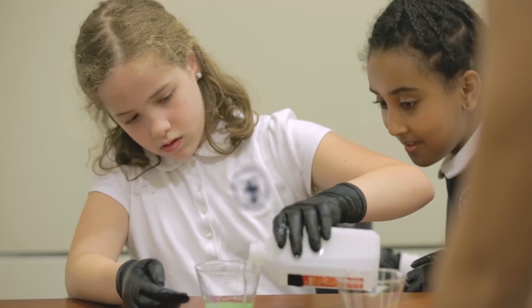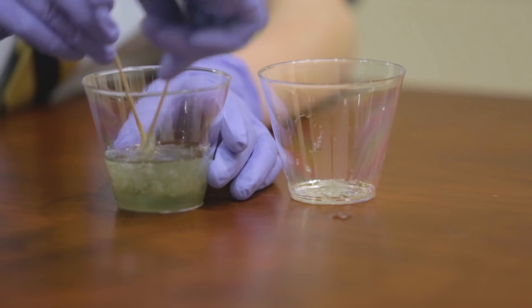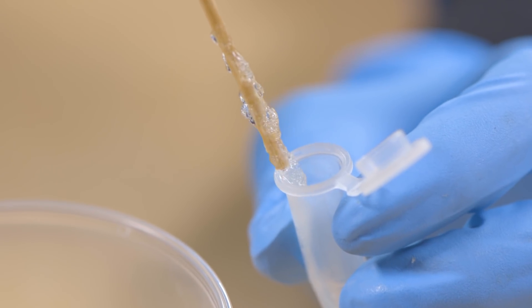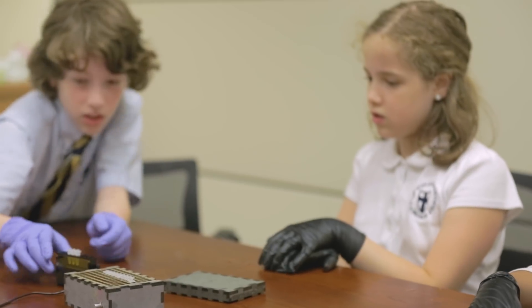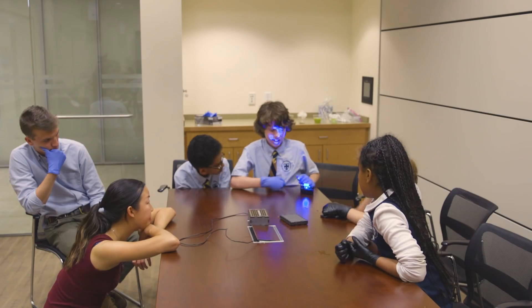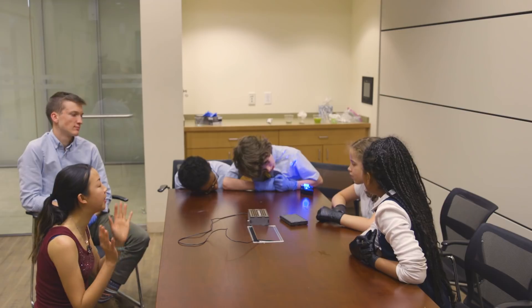The Explorer kit shows we can do other outputs such as smells, tactile-based hydrogels, and fruit sensors. A really popular biology experiment teachers do now is the fruit DNA extraction experiment — you mash up the fruit and extract the DNA, and that's the end of the lesson. But with these cell-free sensors you can add on to that: it can actually detect if something is a banana or a kiwi. The sensor can tell the difference between all these different fruits, and it's always based in the DNA.